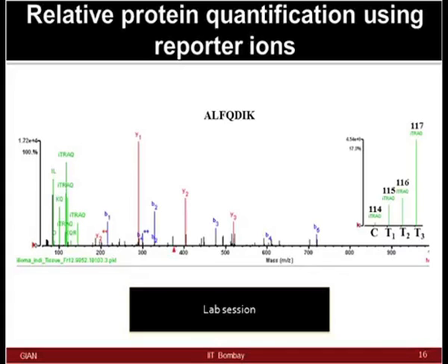So, that you need to show, and you have to report all your data in the supplementary data. Also, now you have to upload all your data files into PRIDE and some other open access databases, where one needs to upload all the raw data files you are generating from the mass spec, because every single piece of data you cannot put in the papers, but the community should have access to your data. Therefore, it is important for you to upload the data in the generic raw data files.